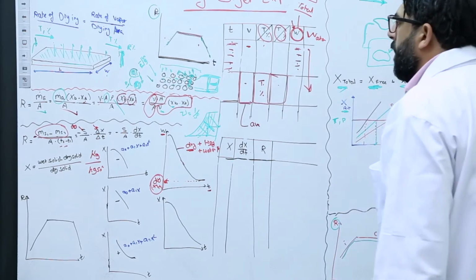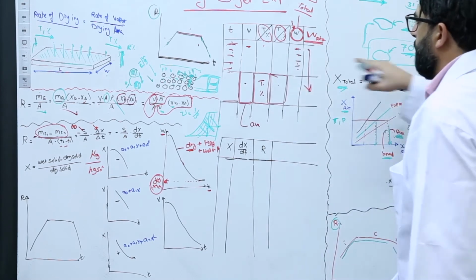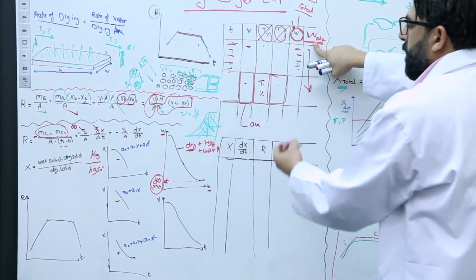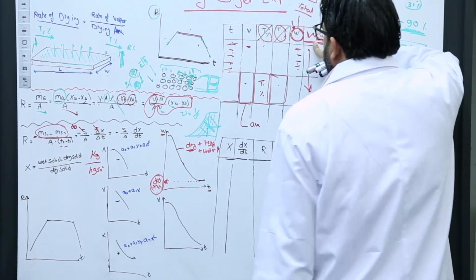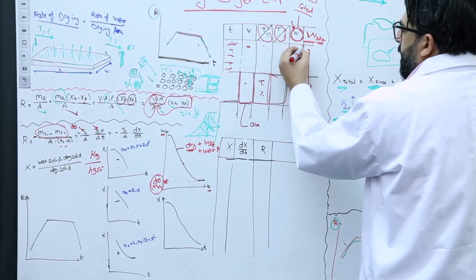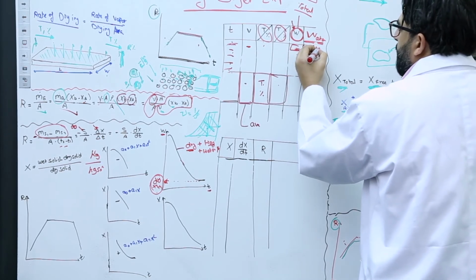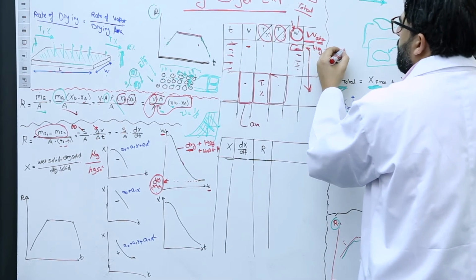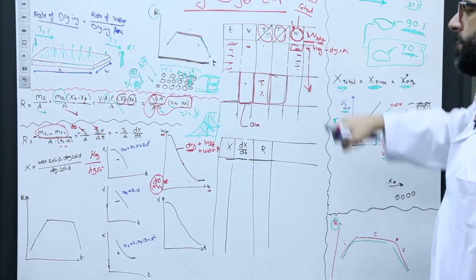How to calculate the W of water? W, water weight. So now we already determined the amount of dry solid, and you already know the tray weight. So water will be this weight minus the tray minus the dry solid. Okay, so it will give you only the weight of water.